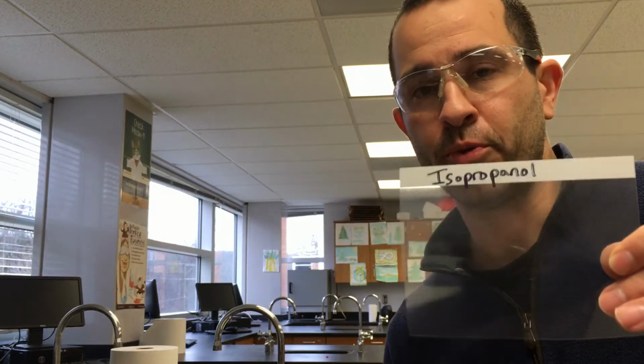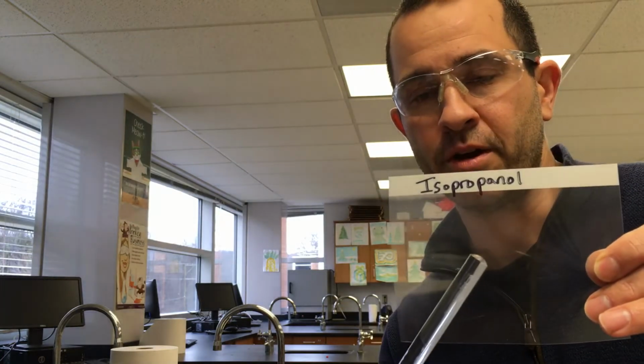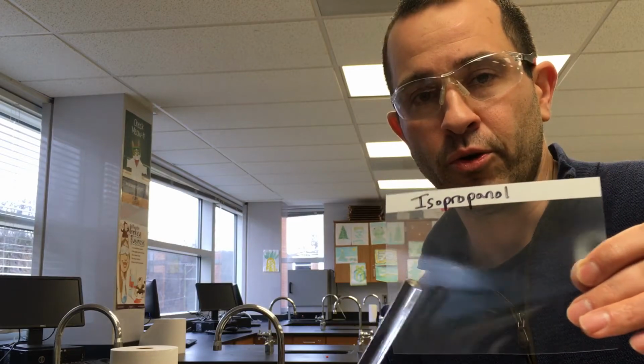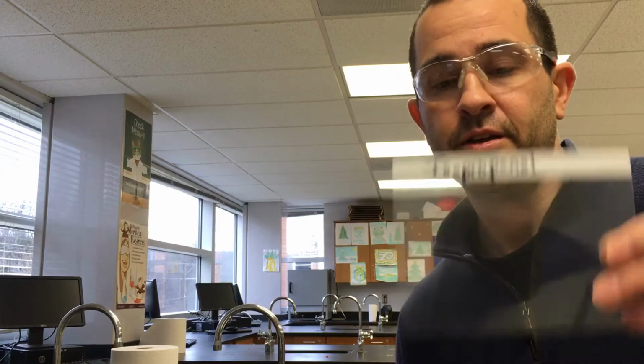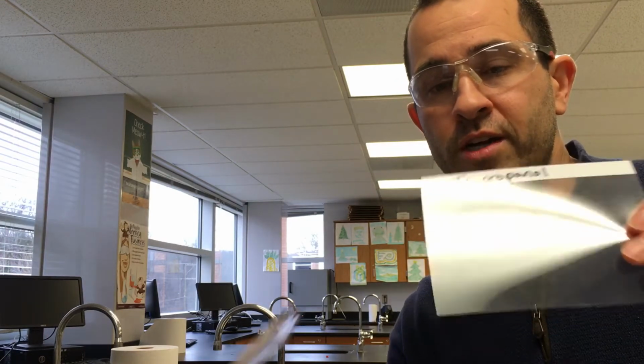So what happens here? Polar molecules are going to attract to other polar molecules. So if we put a droplet of a liquid on this wax paper, if it's a polar molecule, the molecules are going to be attracted to each other, right? The negative end of one molecule is going to be attracted to the positive end of the neighbor. They're going to clump together, right? That's cohesion. So if we have a polar molecule, we're going to see it form a droplet.